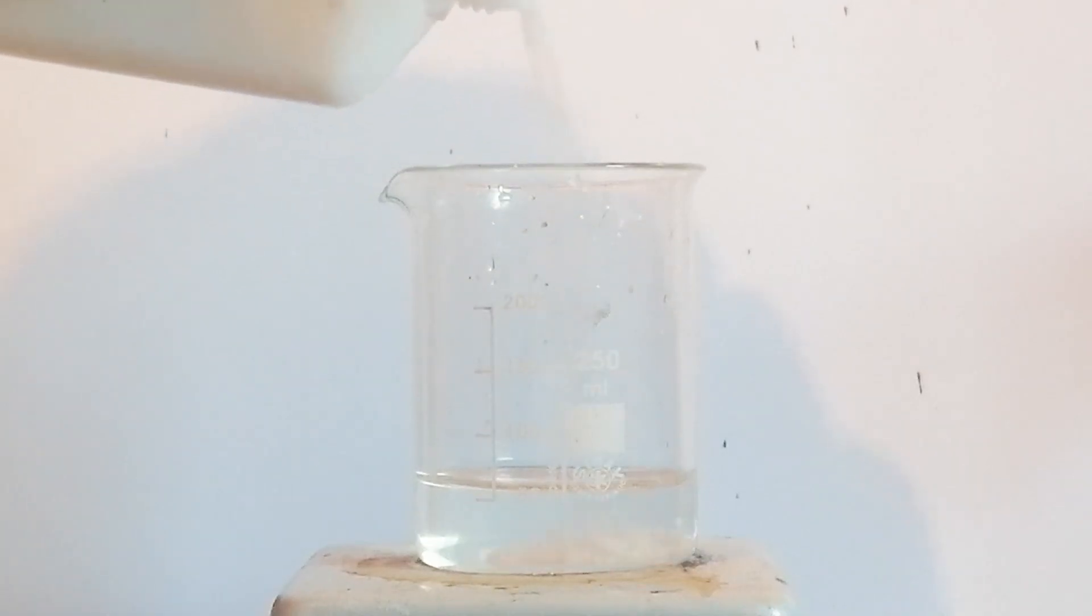First, to a beaker filled with distilled water I've added some sodium hydroxide. Sodium hydroxide is used to create a strongly alkaline environment. I've turned on strong stirring to dissolve the hydroxide faster.